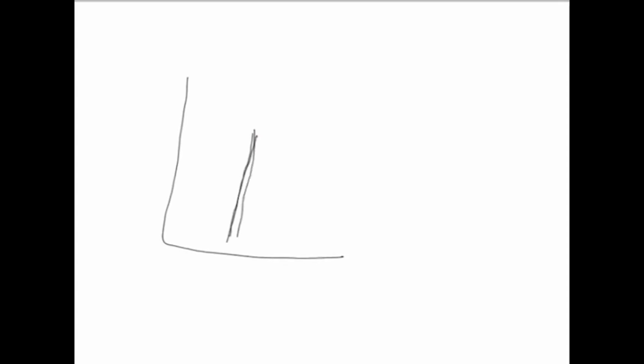So, what you get in real terms is a peak, which does not show these spectral lines, but there are closely spaced spectral lines in here. The absorbance, or optical density as we say, is the readout that comes out. A spectrophotometer is in essence reading the absorbance at a particular wavelength. So, if you plot absorbance versus wavelength, then you will get these peaks at particular wavelengths, and that is lambda max in here.